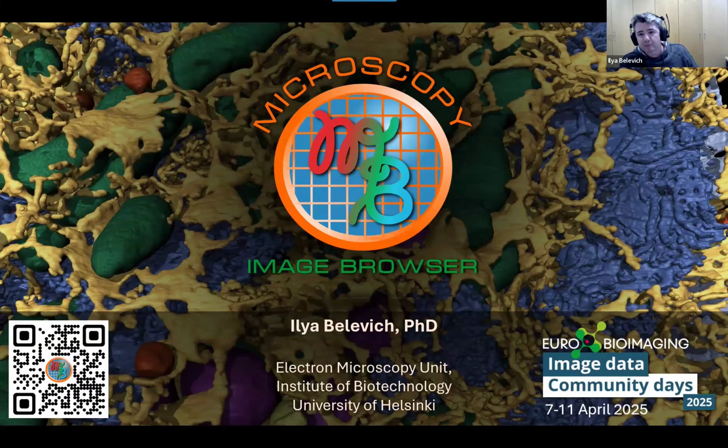And today in these 10 minutes, I'll give you a quick introduction to Microscopy Image Browser. If you haven't used it before, maybe it will give you a good idea about it, and you will try it. If you have used it, maybe you stick to the end, and then you'll see something new.